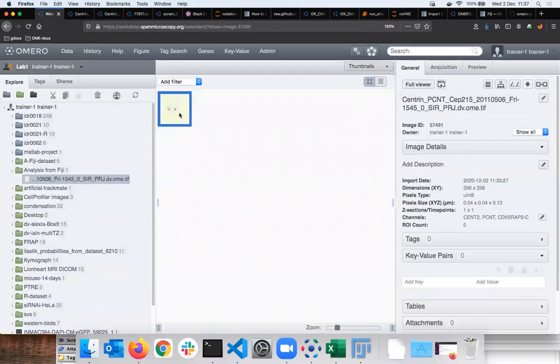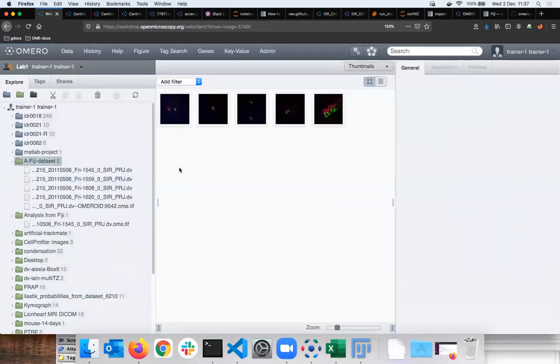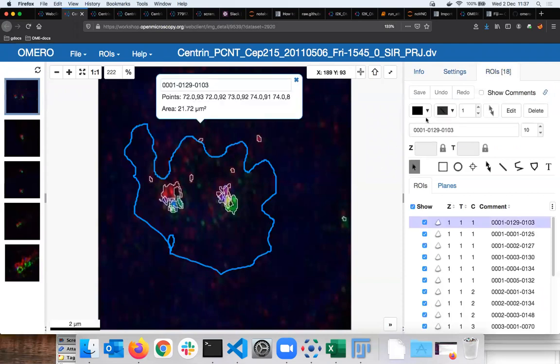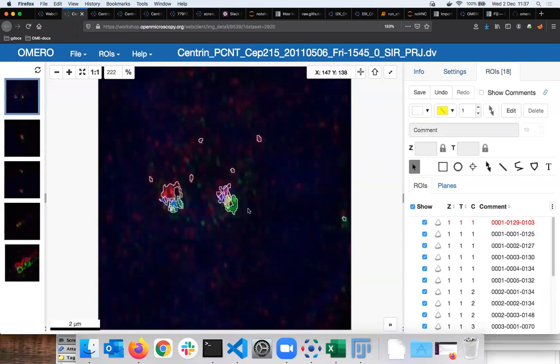And yes, this is obviously the thresholded segmented image. But more importantly, on the Fiji dataset, on the image which is the first in the dataset, I have new regions of interest. This is the old region of interest. I will just delete it for now, which is coming from my manual demonstration. But on top of that, I have here much nicer regions of interest, which I'm just highlighting here, which are coming from the serious segmentation which was done by the Fiji run in the notebook headlessly.